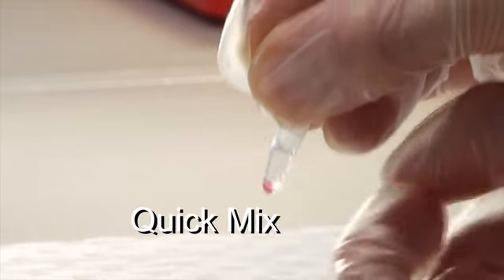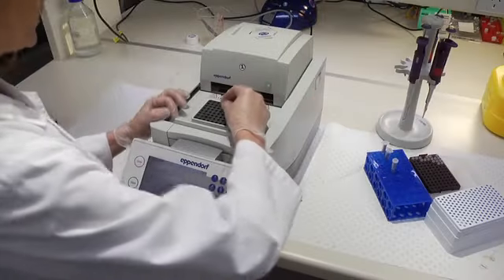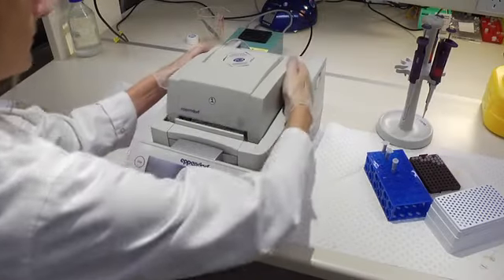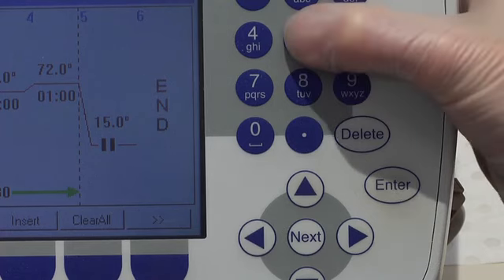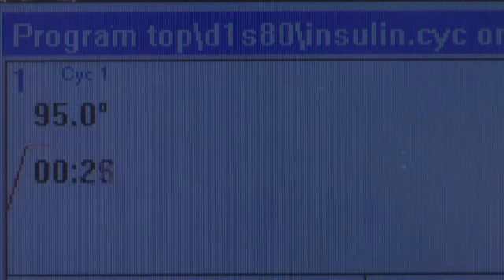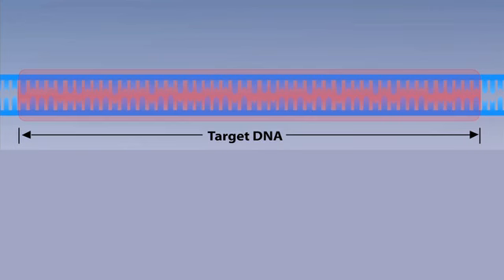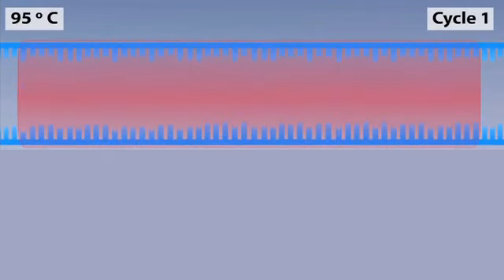A quick mix, and let the thermocycler do the work. This machine changes temperature according to a program I've entered. To start the process, the DNA template is made single-stranded by heating to 95 degrees Celsius.